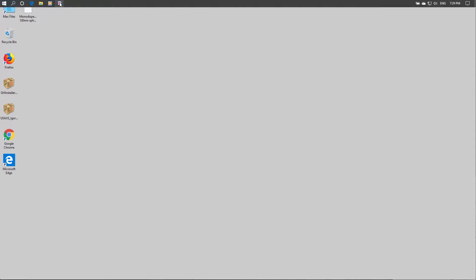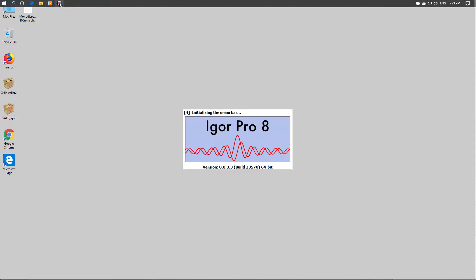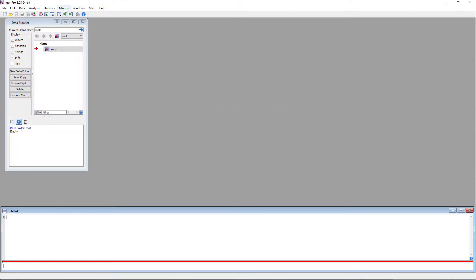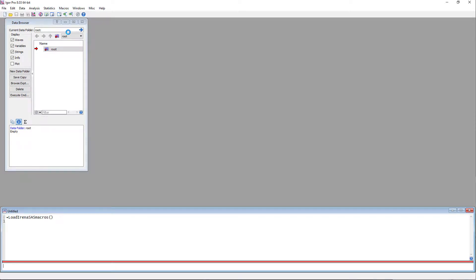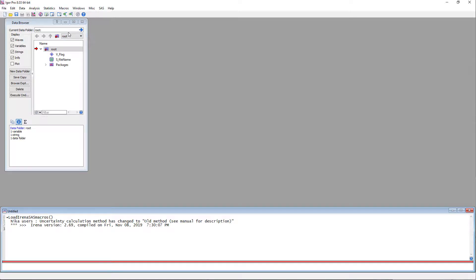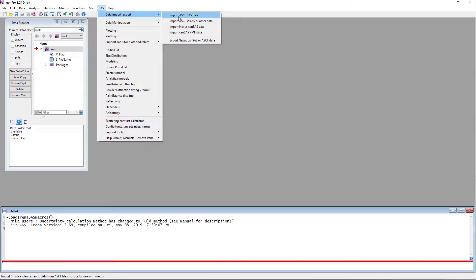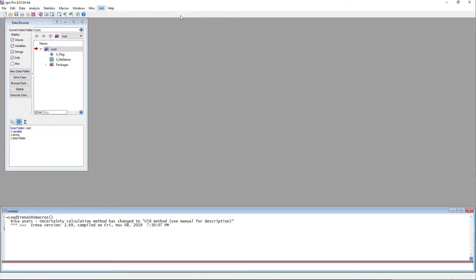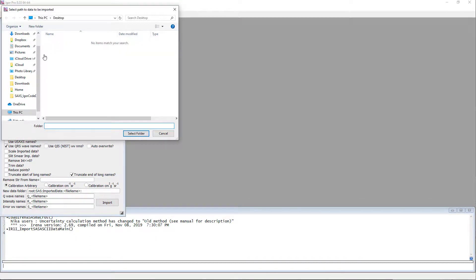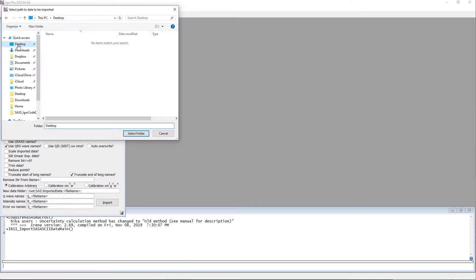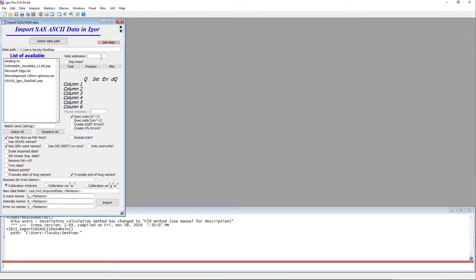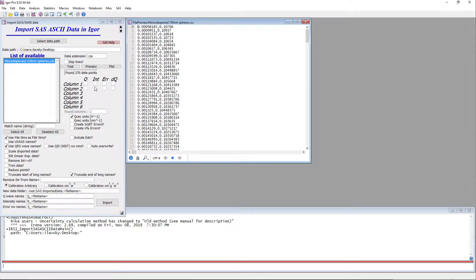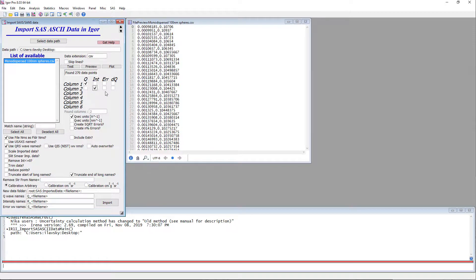First thing is let's start Igor and load in the IRENA package. So now we have IRENA. First thing is we're going to have to get the data in Igor. So I'm going to do data import, import ASCII SAS data, connect graphical interface. We will point the data to the desktop. We can type in here that we have a csv data. Double click or hit test and preview. We have a Q and intensity. There's no uncertainty.